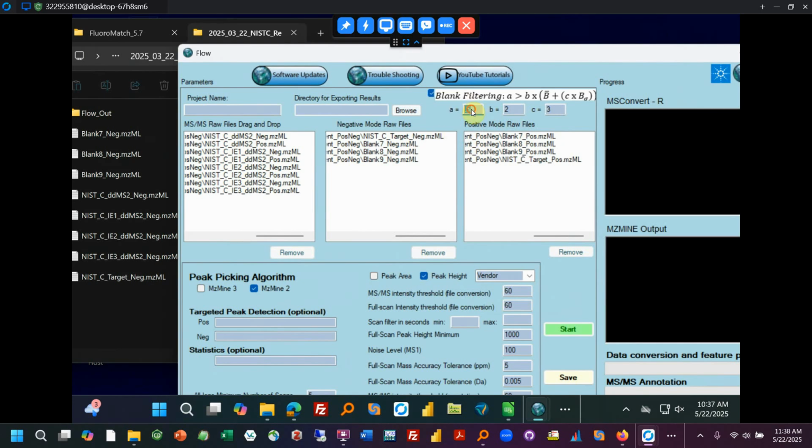So for biological samples, often I put between 0.5 and 0.8. Depends, so that it's not just if one sample all of a sudden is really high because of noise or contamination, that it keeps that sample and keeps a bunch of garbage. So it's a little more conservative, but for environmental samples, I cannot be conservative because any sample could be interesting to me, so I'm going to keep it as 1.